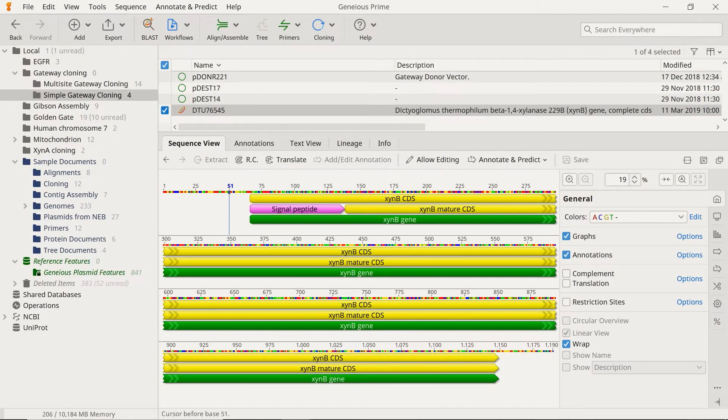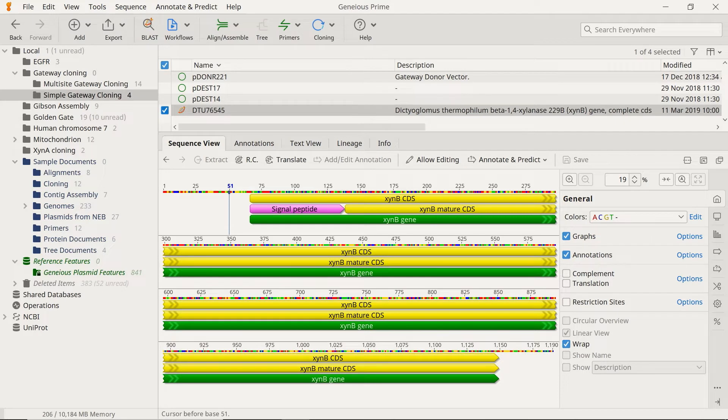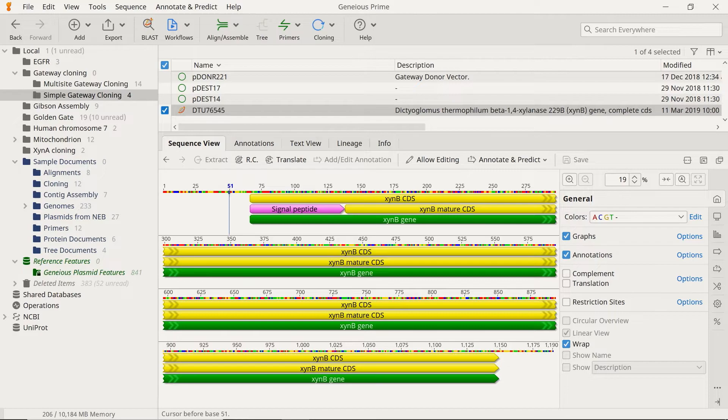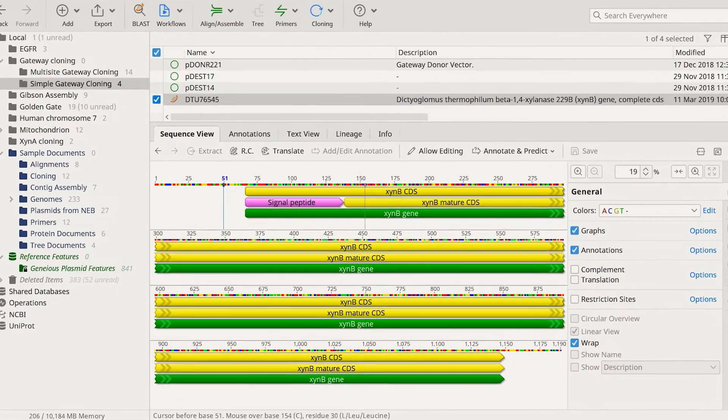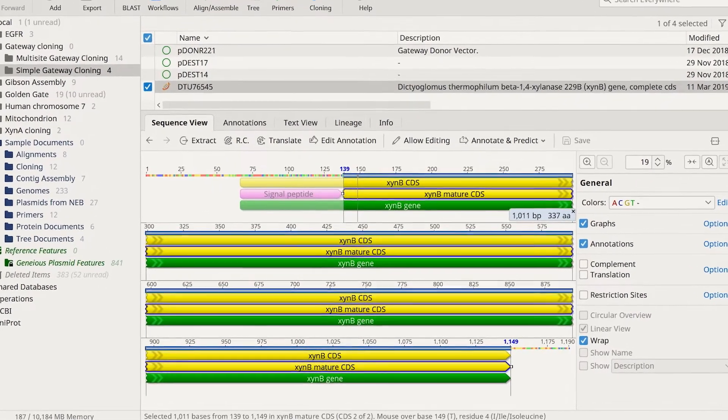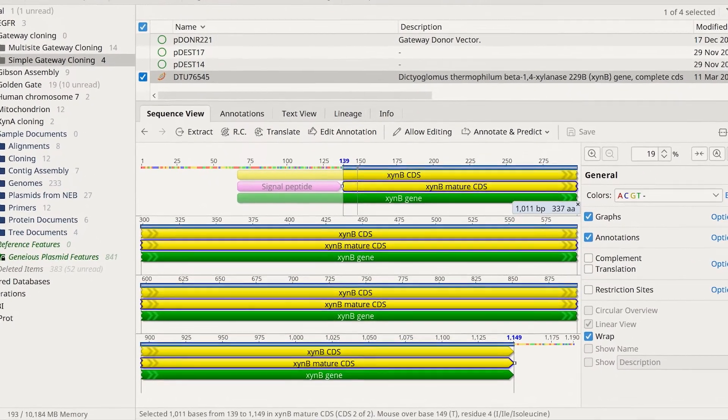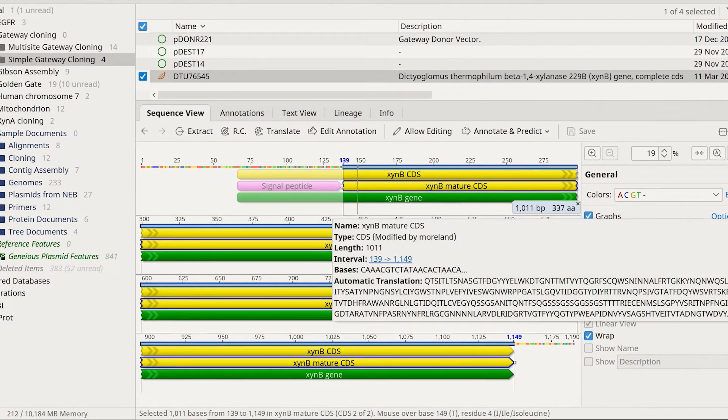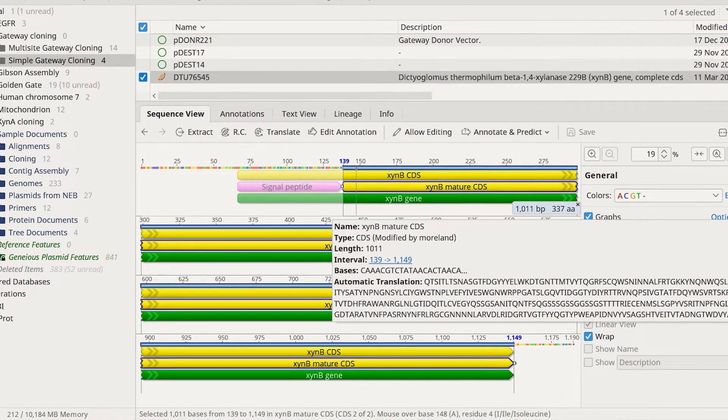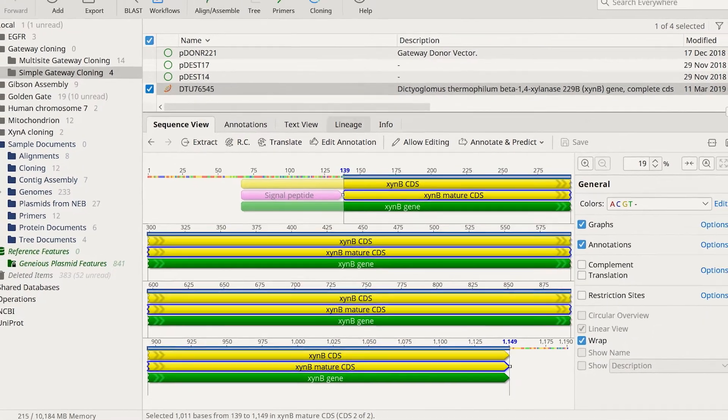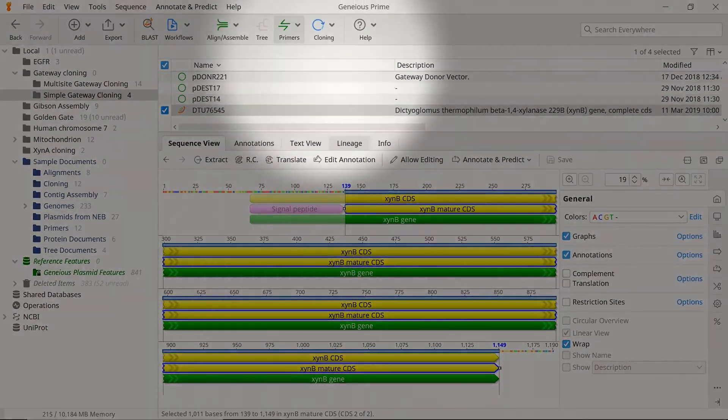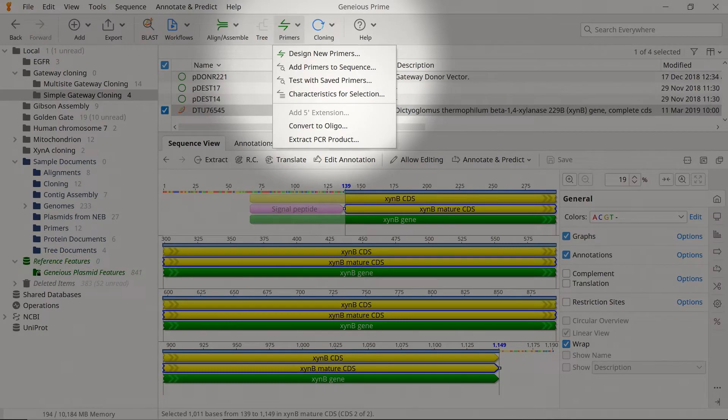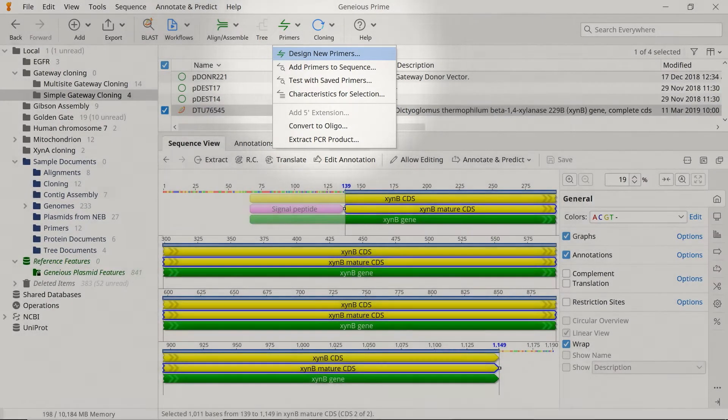Begin by designing primers to amplify a sequence of interest and incorporate the attB sites required for the BP reaction. There are two ways to do this. Either click and drag to highlight your region of interest or simply select an annotation on the sequence. Then, select the Primers button and choose Design New Primers.